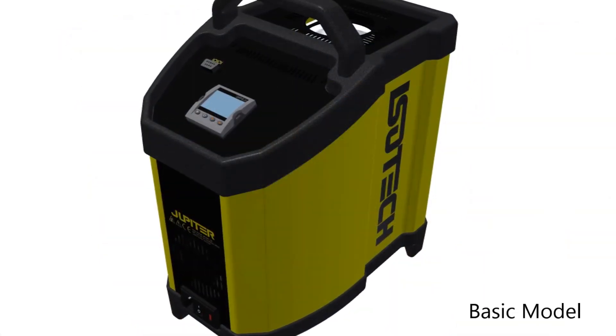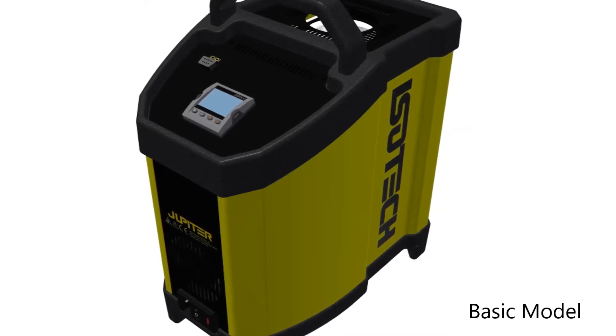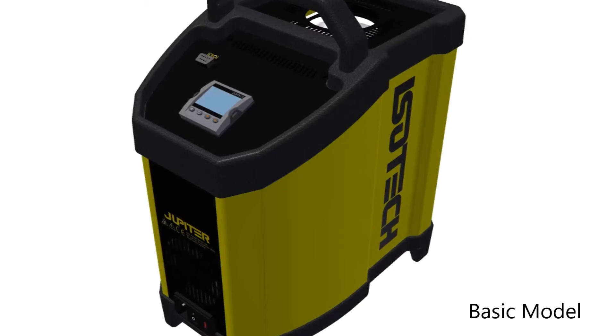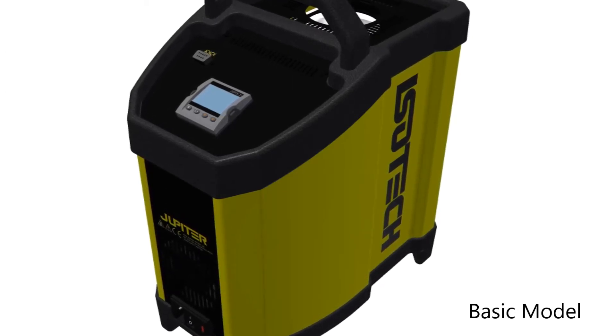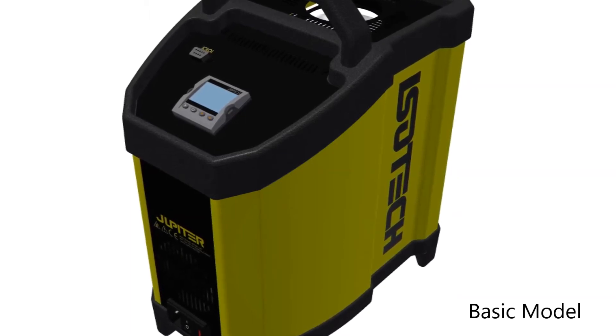The basic model is simple to use and outstanding value for money, perfect for quick and easy testing. It features a digital display of set and nominal block temperature, and is best used with a separate external indicator to compensate for temperature gradients.